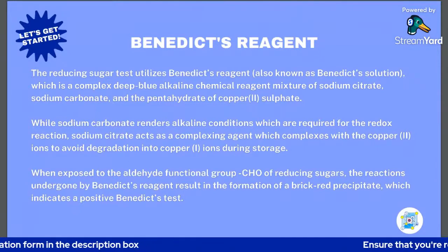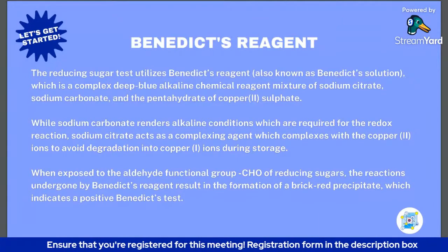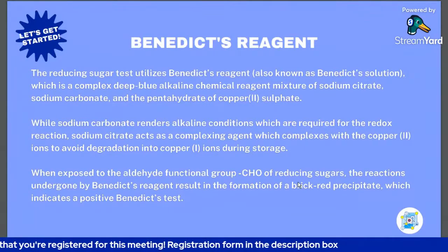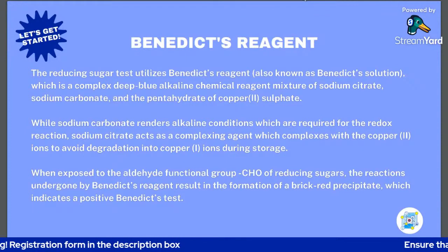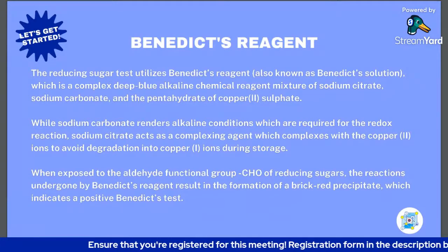But you're going to see it's a deep blue alkaline mixture of sodium citrate, sodium carbonate, and the pentahydrate of copper sulfate. The purpose of your sodium carbonate is to provide an alkaline condition for the redox reactions that are going to happen.